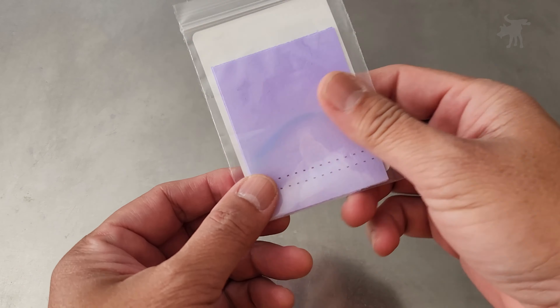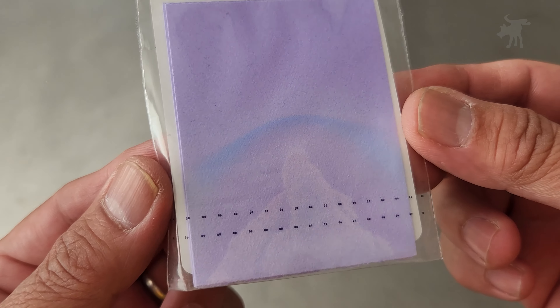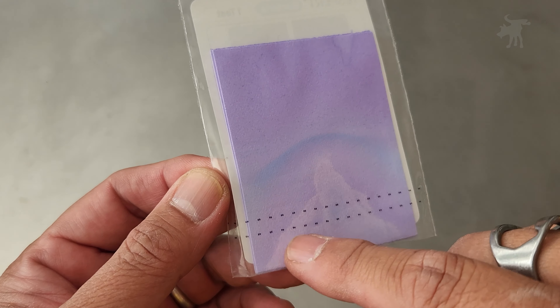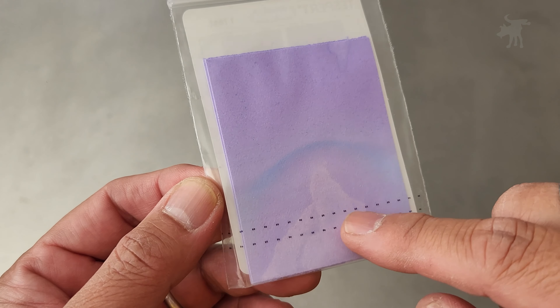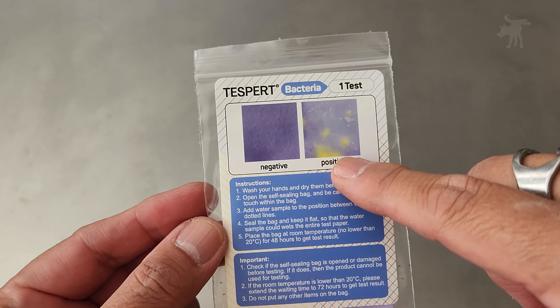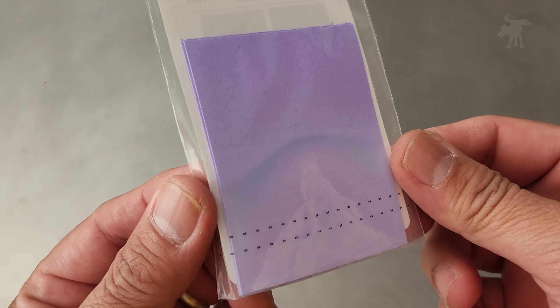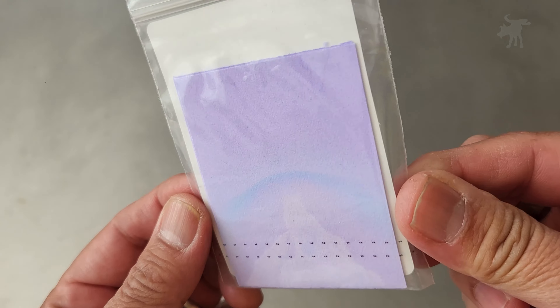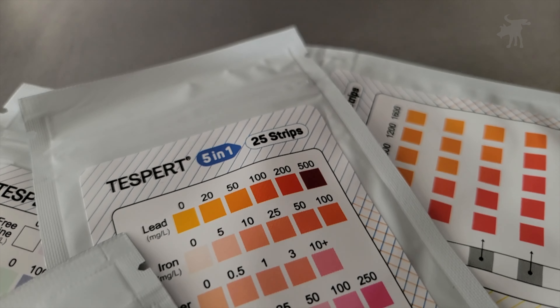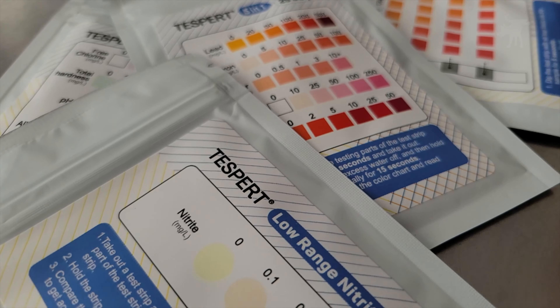This is our card 48 hours later, and I've had it at room temperature away from direct sunlight. As you can see here, there is some discoloring at the bottom of this test strip, and I believe that designates that there is a presence of bacteria in this sample. So yes, this does work, though not nearly as pronounced as the big yellow splotches on the sample shown. But you can see some discoloration on this test strip, so it does work.